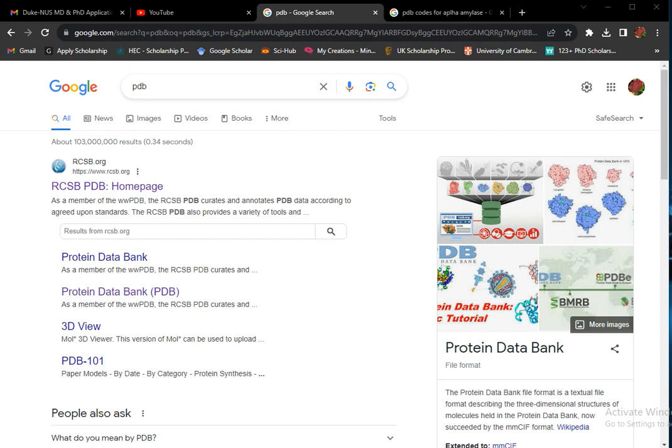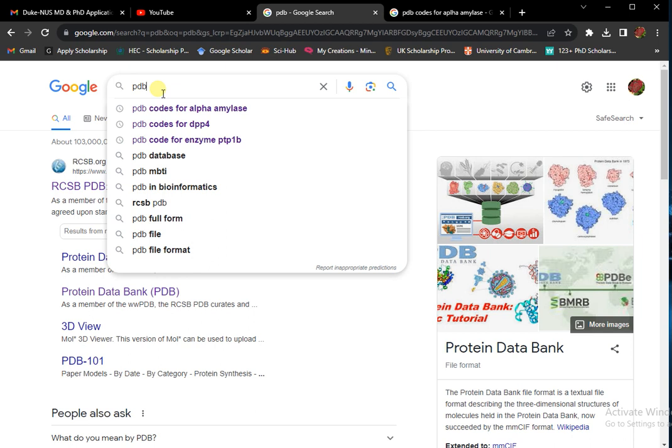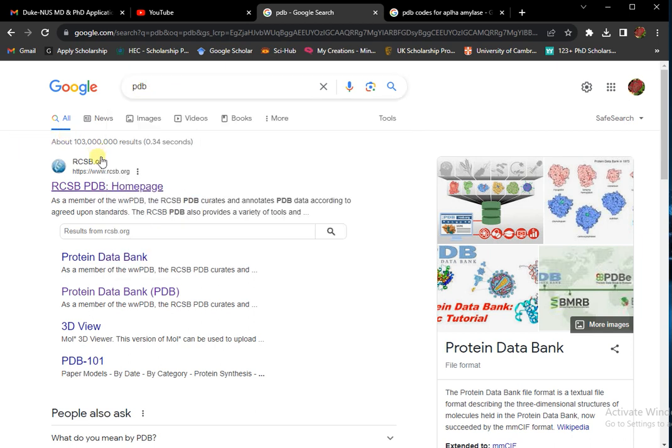This is our second video on the MOE series. So, the first step is how to download our protein from an online source. For this, the best source is the PDB protein database. Simply write PDB in the search bar and open it.